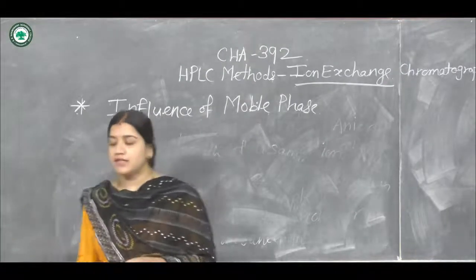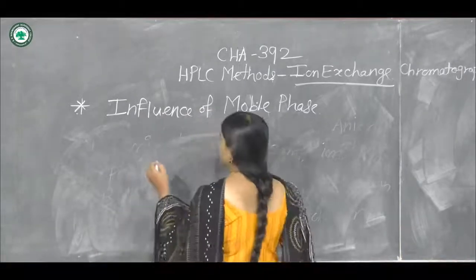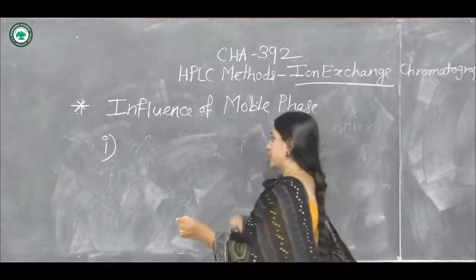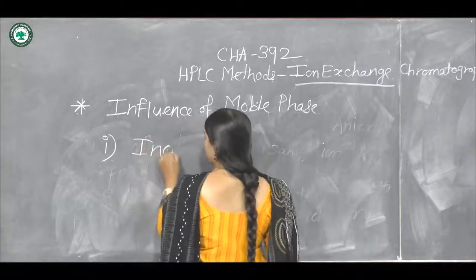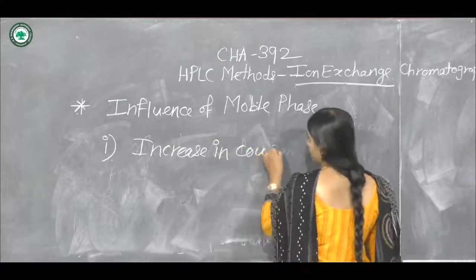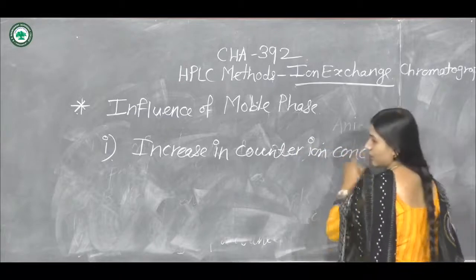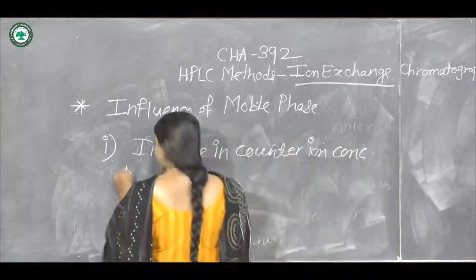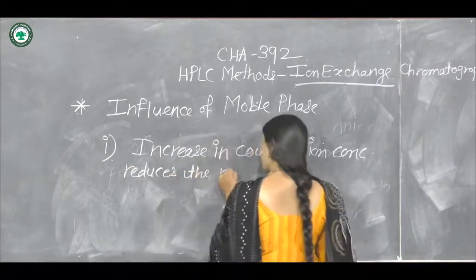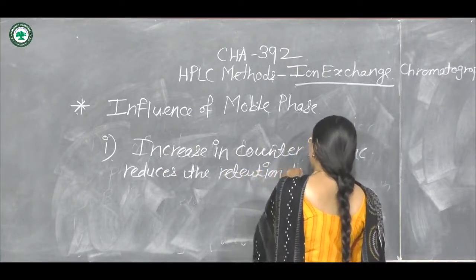an increase in the counter ion concentration reduces the retention time.